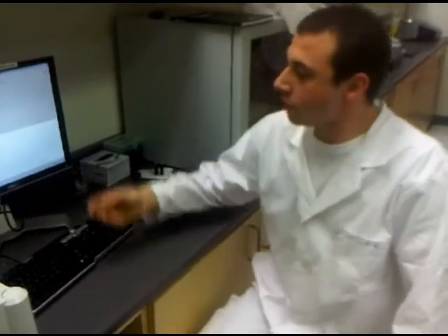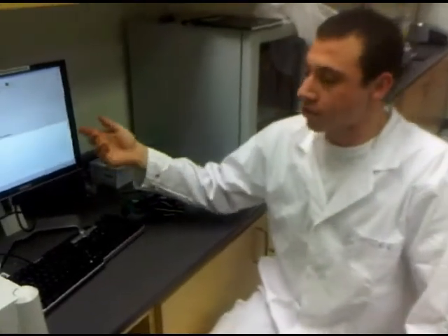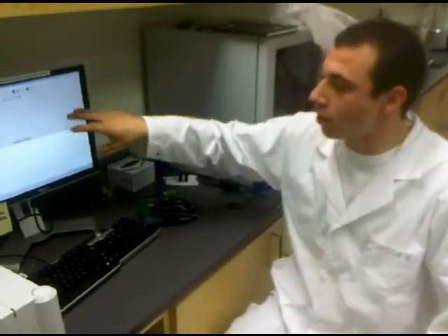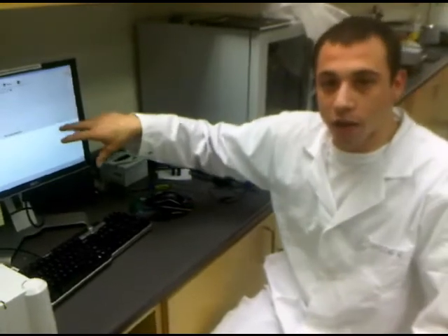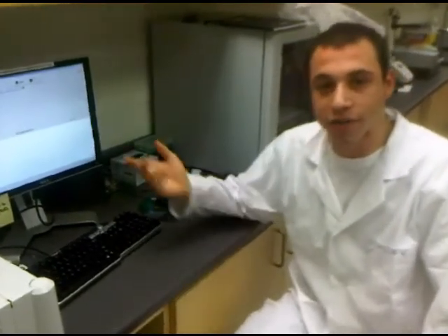By using this method and preparing a few standards with known concentration, you can make a standard curve with the absorbance that you get using the Enzyme Kinetics. This way you can actually find the concentration of the unknown with enough certainty because of the standard curve. Thanks a lot, I'm Chad, and I hope you've learned a lot about the UV spectrophotometer. Thank you very much.